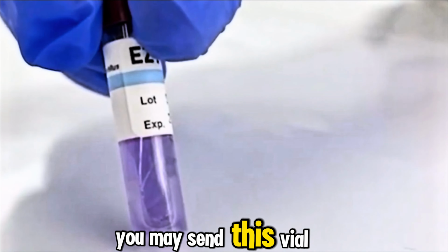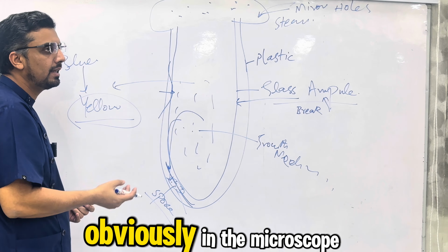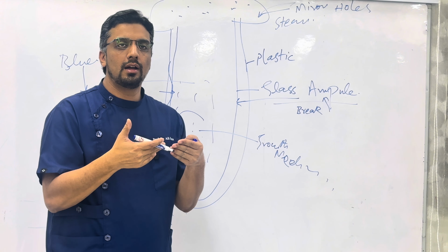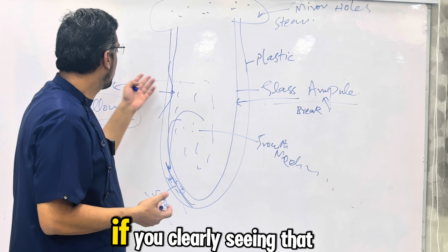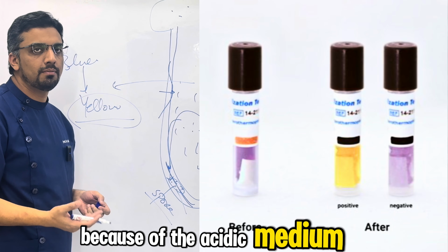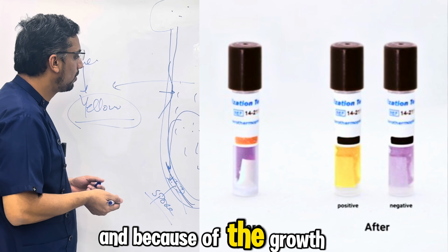You may send this vial to the lab. Obviously, under the microscope, you would be able to see the growth of the spores, or alternatively, you can clearly see that the color has changed, and this color has changed because of the acidic medium and because of the growth in the vial.